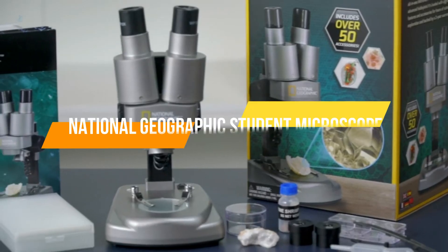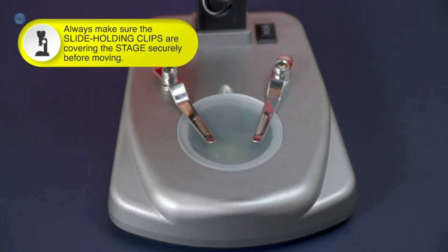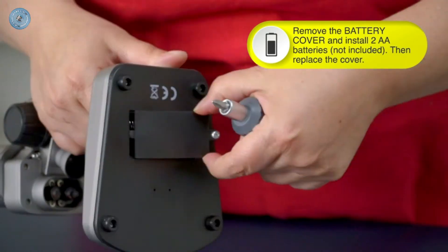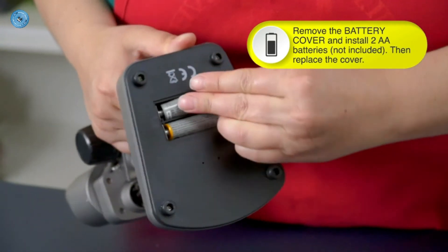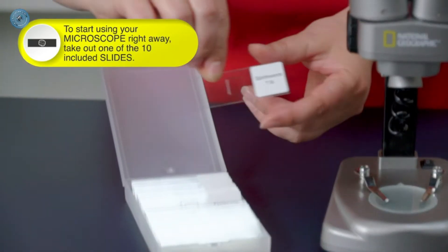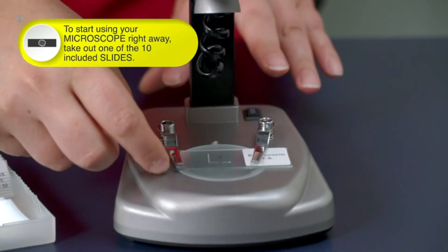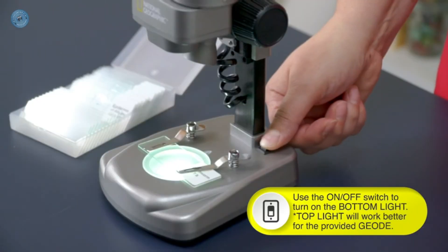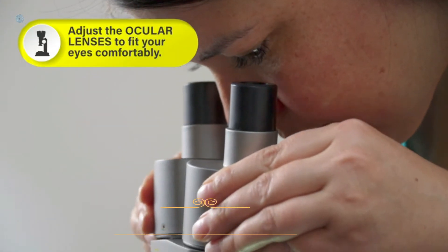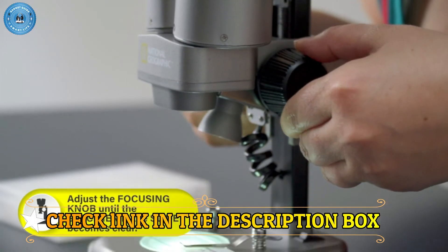Number 2: National Geographic Student Microscope. Two microscopes in one — use the lower LED lights to view biological specimens on slides, or switch to the upper lights to examine 3D objects in intricate detail. The perfect STEM activity for boys and girls. Over 50 accessories included. Explore a curated set of 10 prepared slides with a range of biological specimens, then create your own with included blank slides and covers, tweezers, and an eyedropper. This complete kit also includes a petri dish for plant labs, a mini geode, and more.